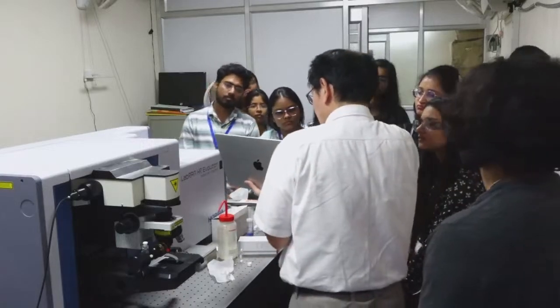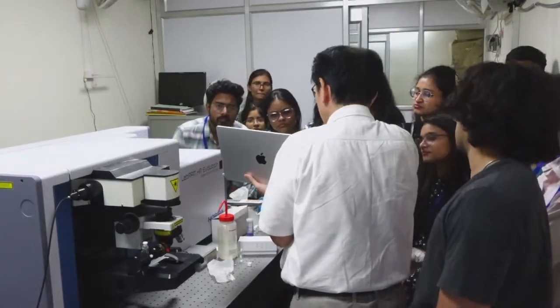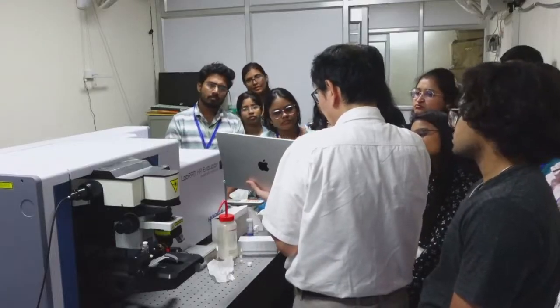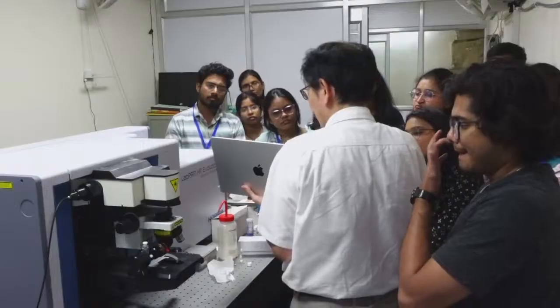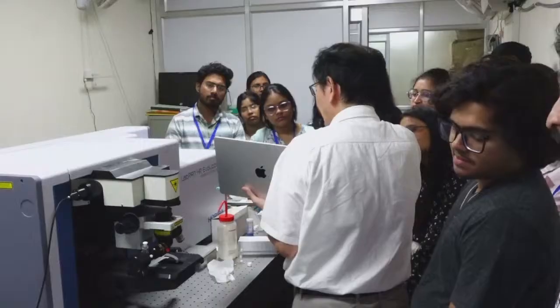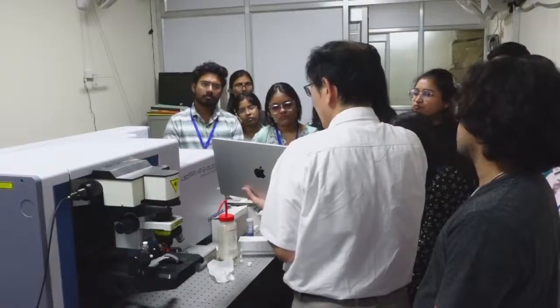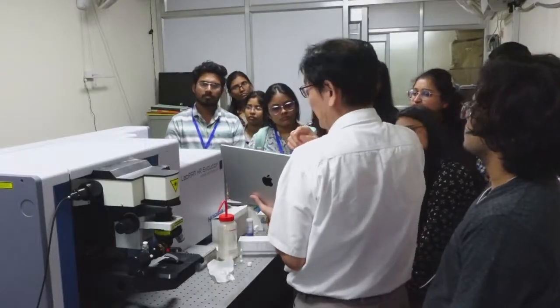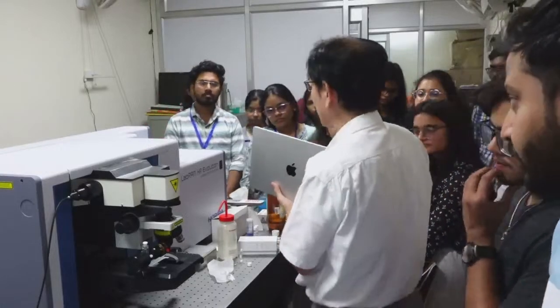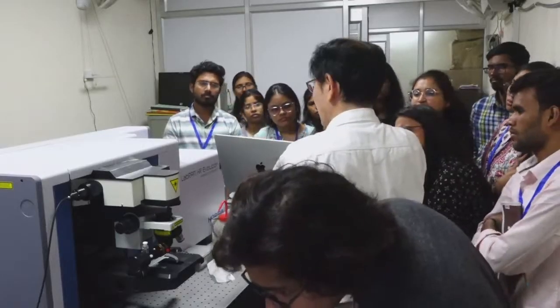Okay, so the signal count is now 20 or 30 counts. When we prepare the figure for publication, we need to collect 1 million counts to ensure good SN ratio. So now the measurement time is 6 seconds multiplied by 4 times, so nearly 30 seconds, 24 seconds, and we get this data.